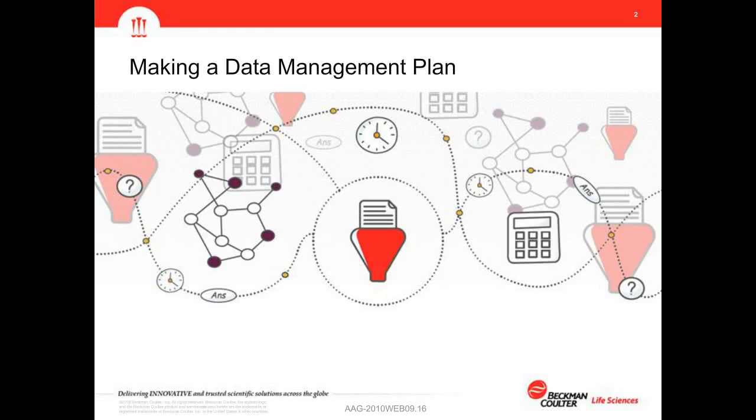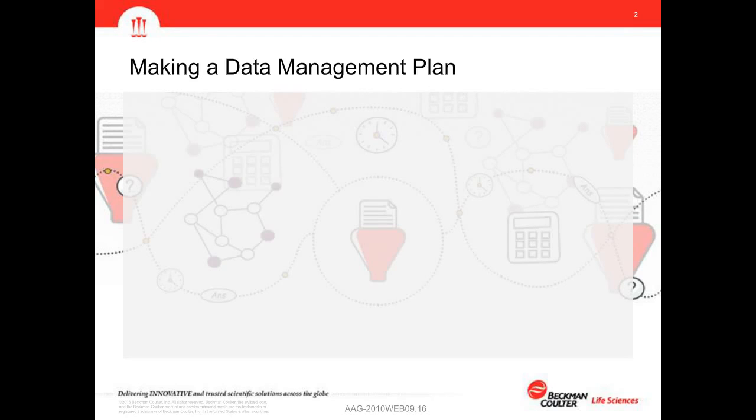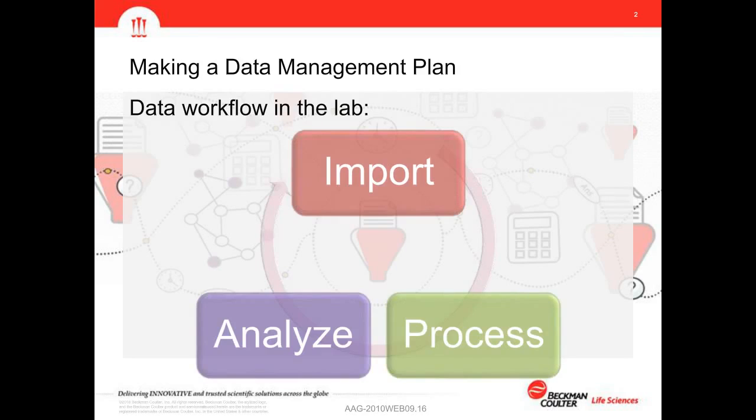As we look at a data management plan, this is a little different than a data plan on your phone. This is something where you want to be looking at planning out how your data flows through a system. And data means a lot of different things. There's different layers, different types, there's different ways of looking at things, and it means a lot of different things to different people. So today we're going to take a look at how we can organize data in a way that is more meaningful and that can drive results through your assay.